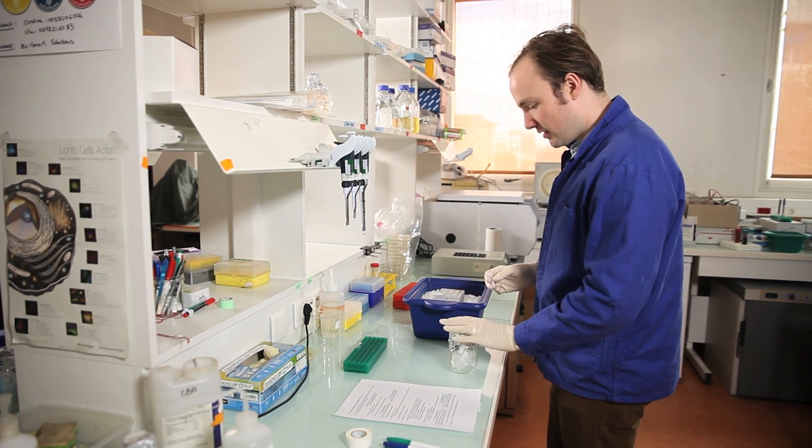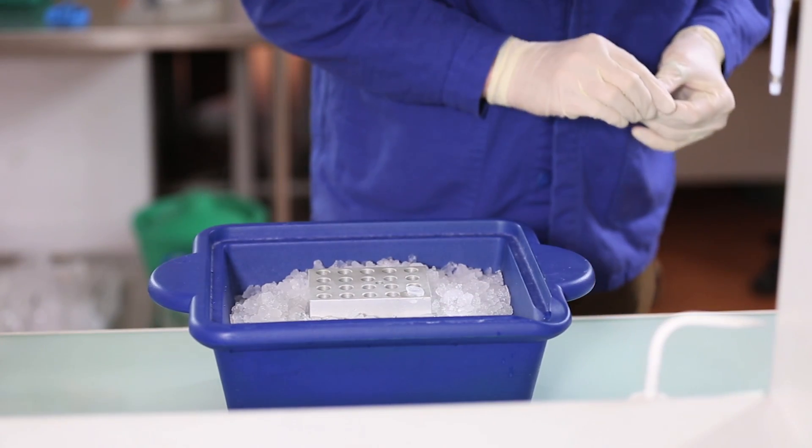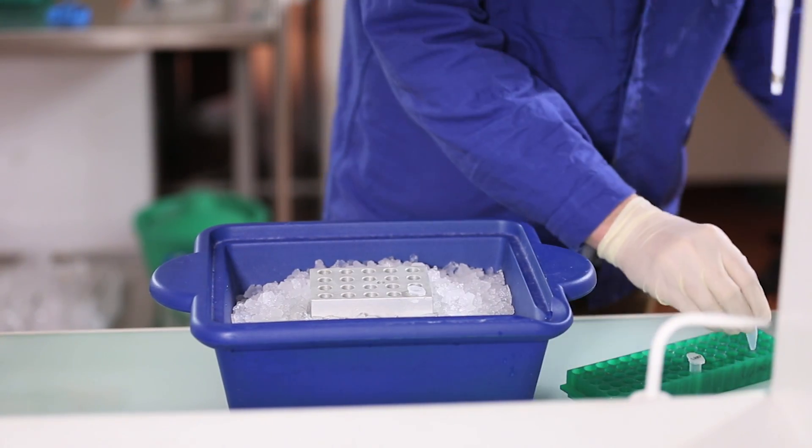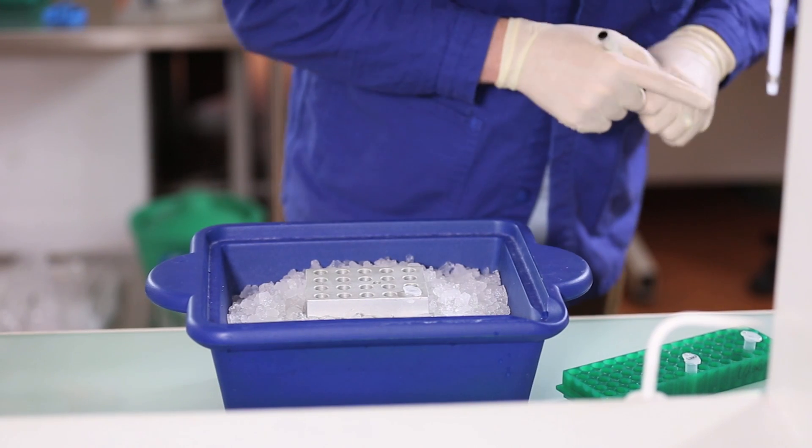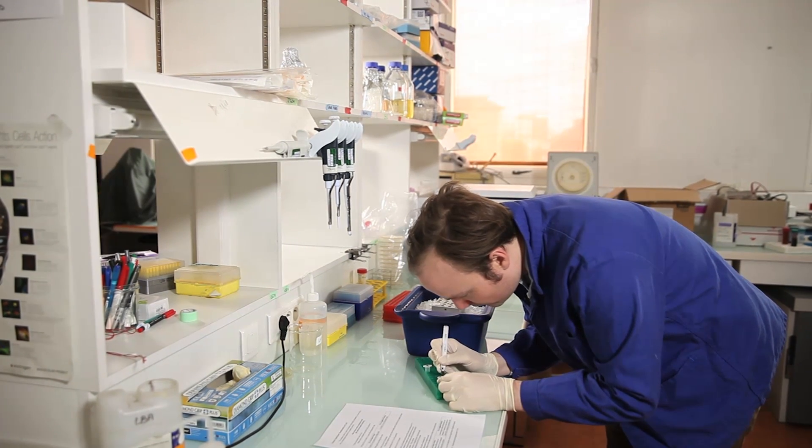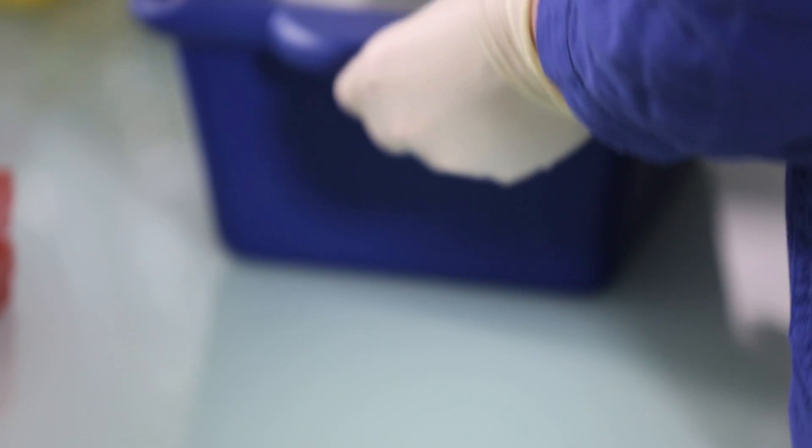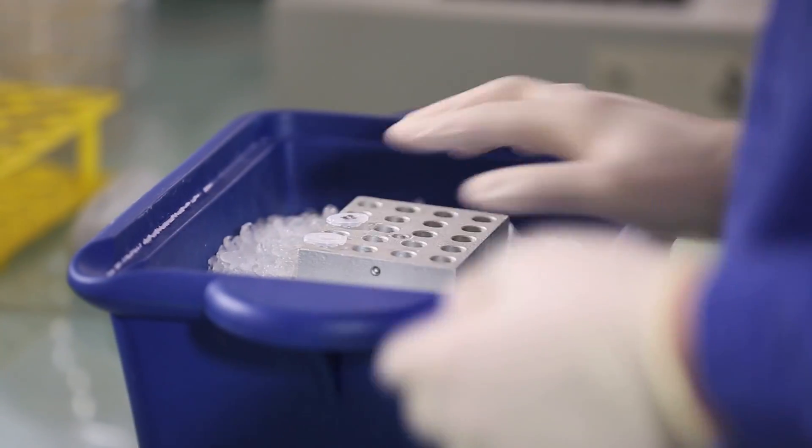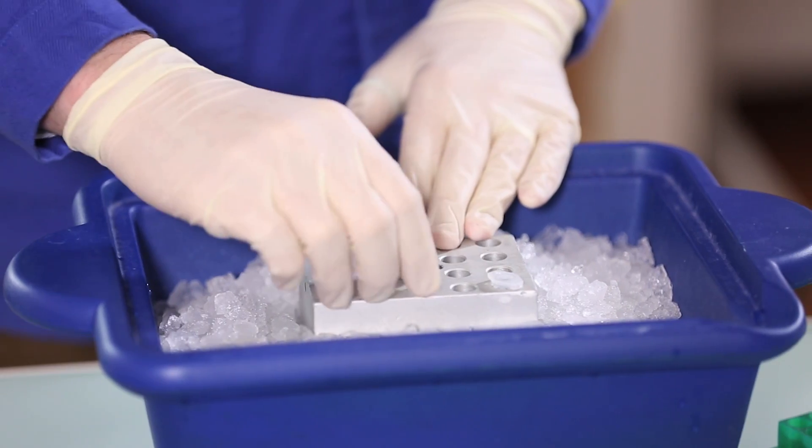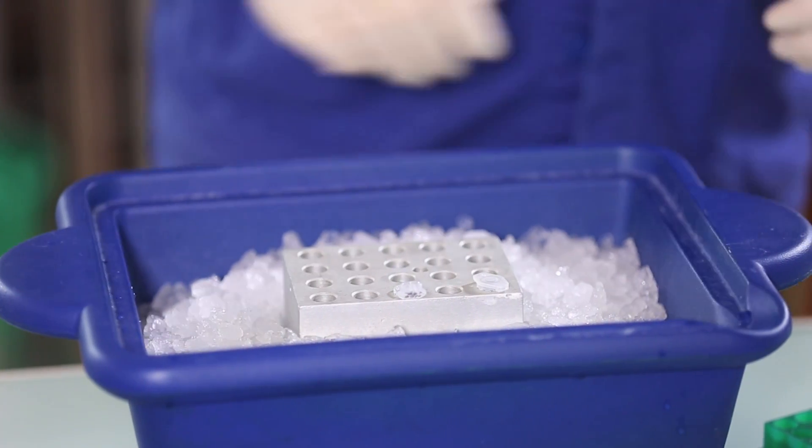So I will take my aliquot here. Don't forget to label. Okay, I'll put that on ice. Let that cool for a couple of minutes and then I'm going to aliquot 20 microliters of competent cells into that tube.